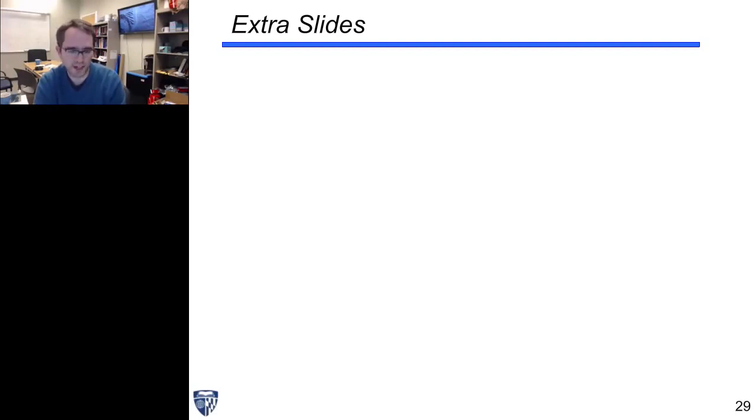But the answer is definitely yes. It's possible. We just need to train. The trick is generating the right training set so we can say with confidence where the hydroxymethylcytosine is, and if a molecule does have hydroxymethylcytosine, methylcytosine, or normal cytosine.